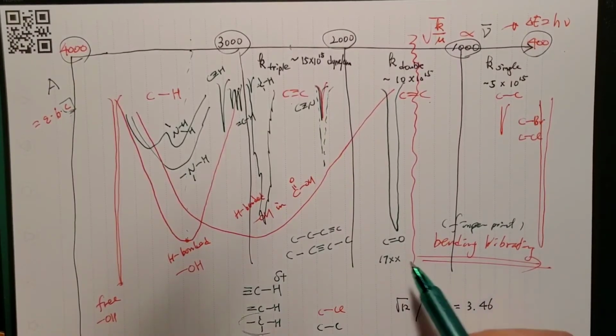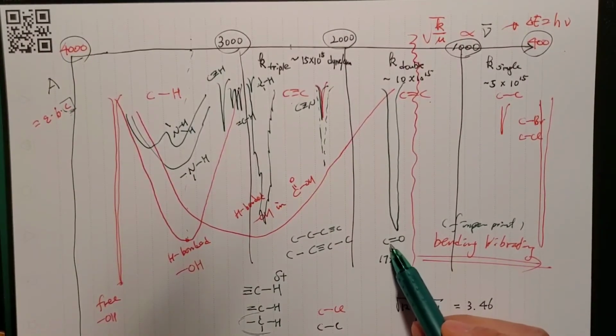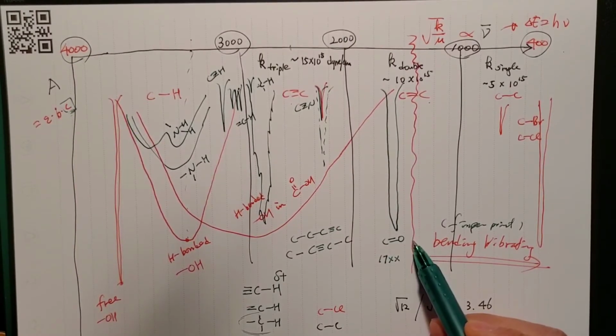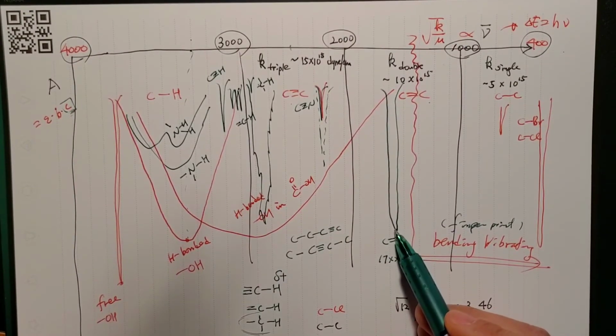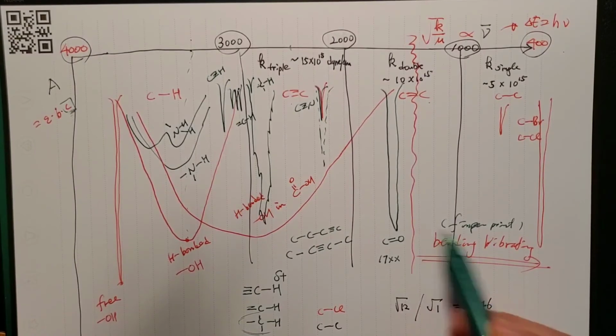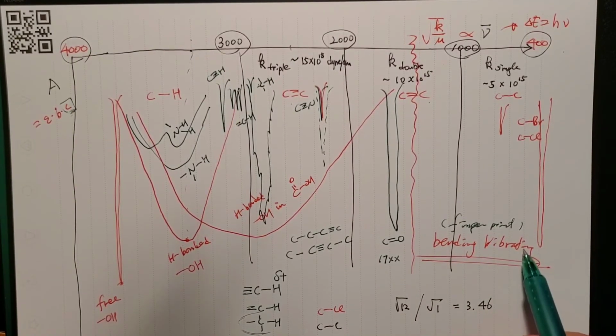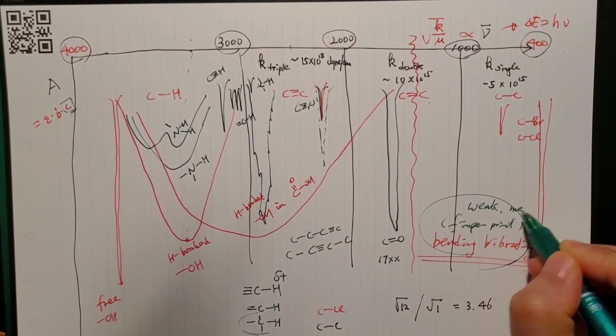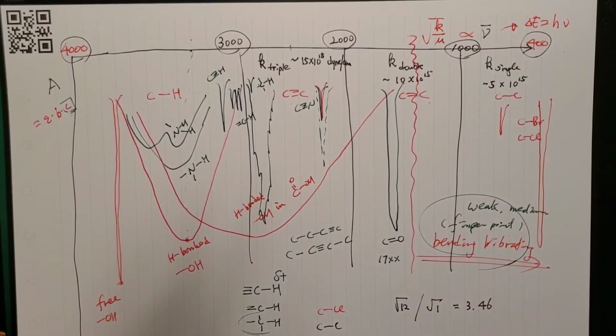Anyway, the CO double bond, even with other circumstances, is usually above the 1450. But even if it went under, it doesn't matter, because your bending vibrations are not giving strong signals. They're usually weak or medium-sized signals. So the CO double bond is safe. You're not getting confused. So you can always check carbonyl with an IR.